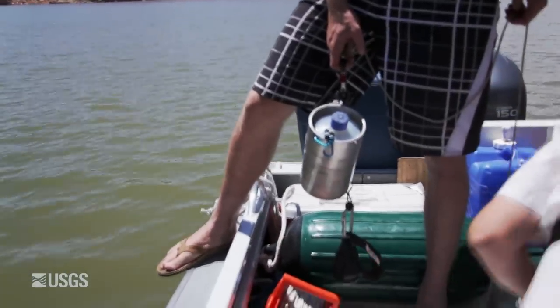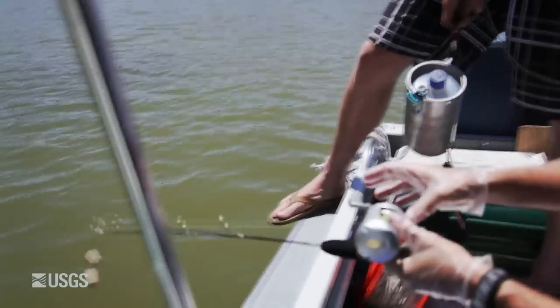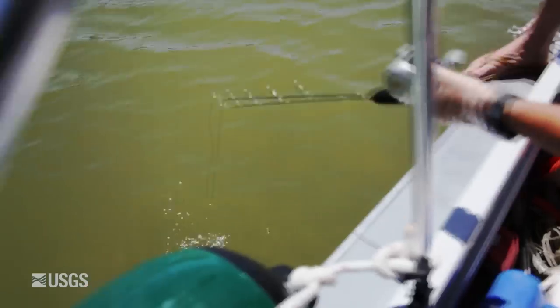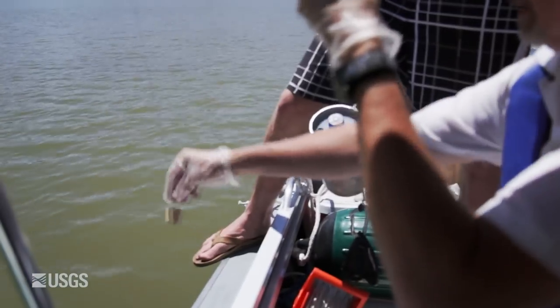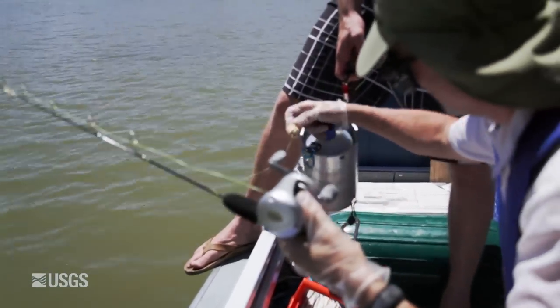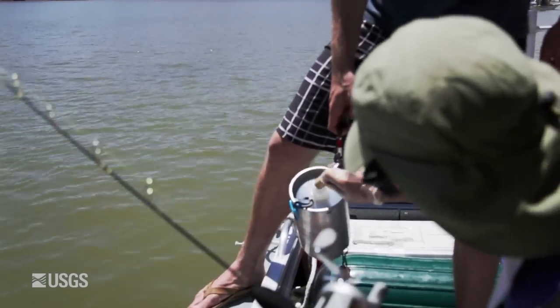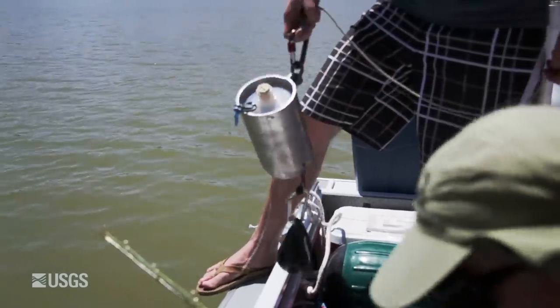The idea is to collect a water quality sample at a specific depth. We lower the bottle to that depth, whether it's two meters or whatever. The bottle has a cork in it, and the cork is attached by fishing line to a fishing pole. When we get to the depth we want, we give a yank on the fishing pole and that pulls the cork out, and the bottle starts to fill.